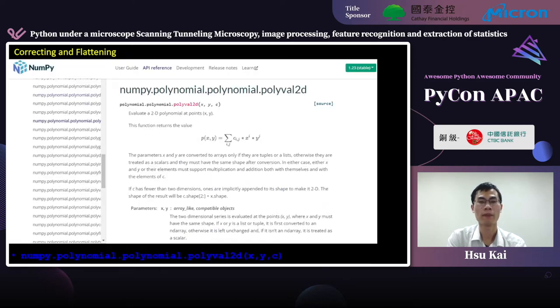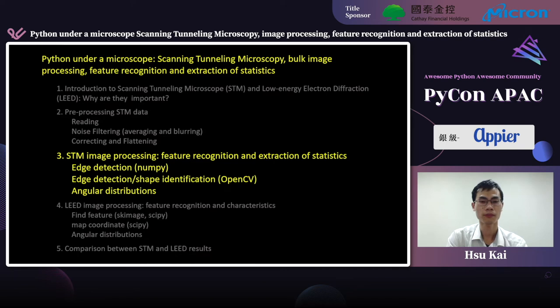The final STM artifact I'm going to talk about is the flatness issue. First, when we mount the sample on the sample plate, it is not possible to manually mount the sample flat on the nanoscale. And secondly, when scanning large distances using tube scanners, the scan plane often follows a curved surface. So, it is often necessary to flatten the data with second-order or even high-order polynomial fitting. And here, NumPy polynomial gives us such function. We can evaluate a 2D polynomial at our data points.